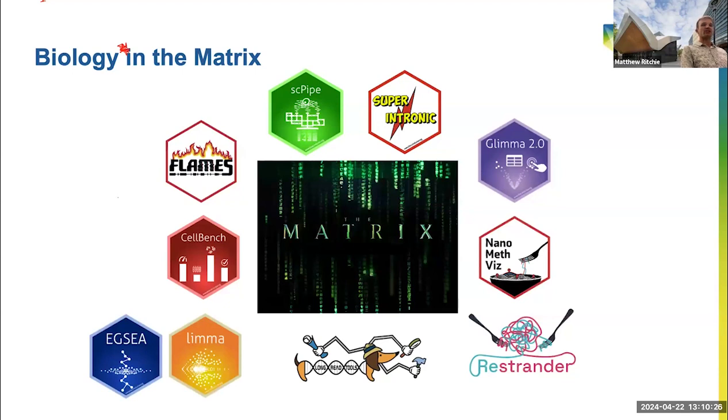And if I think back to microarrays and then bulk RNA-seq, there's obviously tools for, again, prioritizing the rows in your data matrix to hopefully send to your collaborators so that they can validate things in the lab. And so software like limma has lots of methods for that, and EGSEA for kind of gene set enrichment analysis, where you apply lots of different methods to your data to come up with some consensus approach.